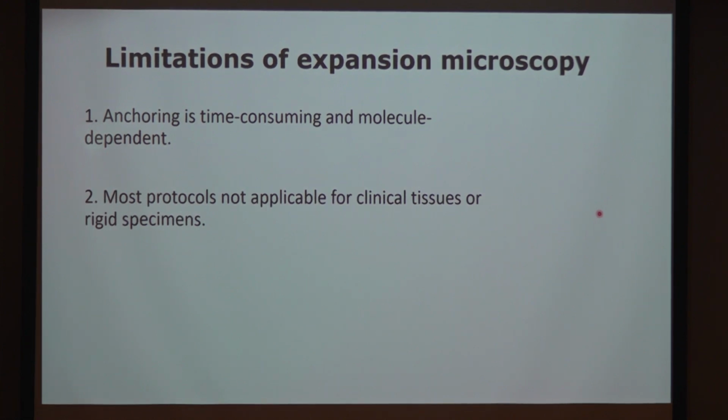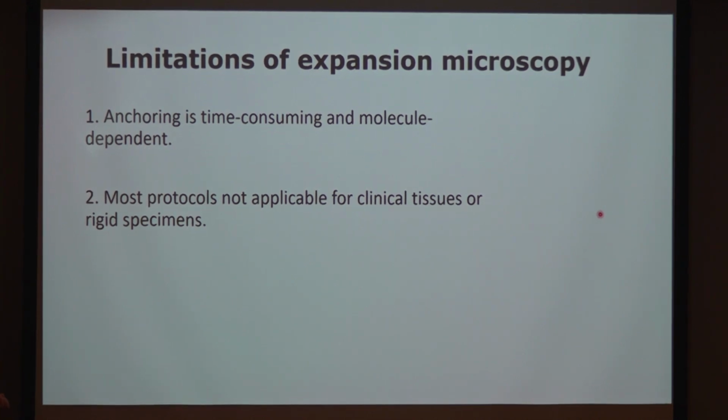The second limitation is that for most protocols, it's a problem to expand some clinical tissues that are usually very rigid because they're fixed and embedded, right? So the biopsy samples are especially difficult to expand.